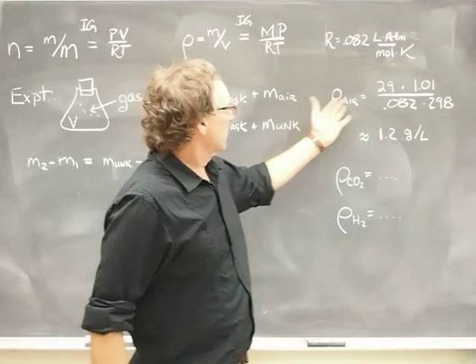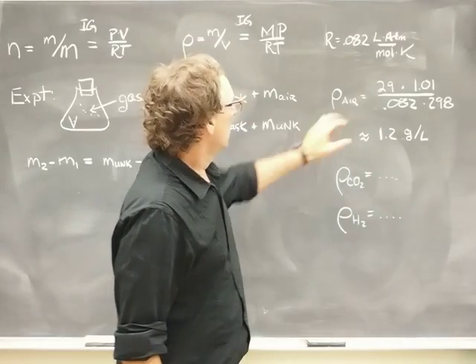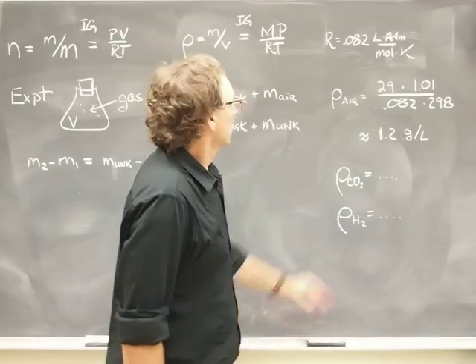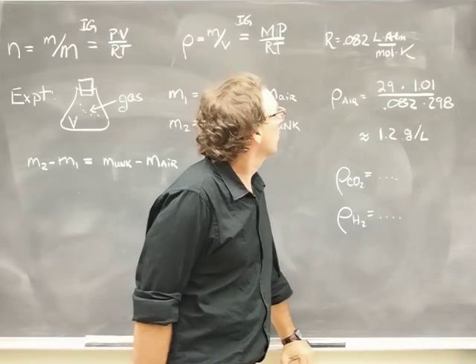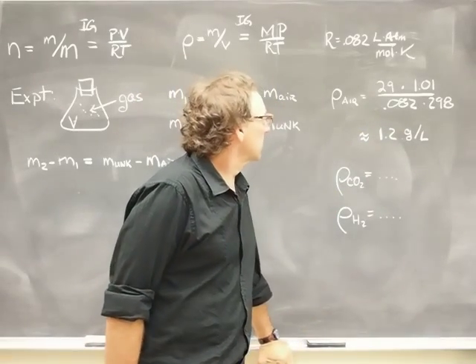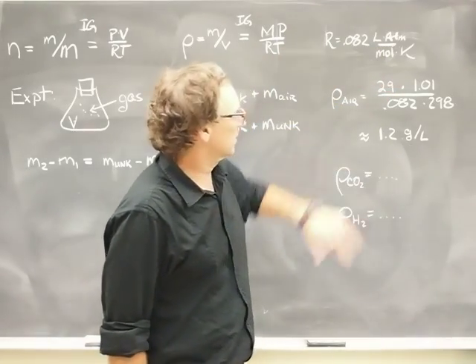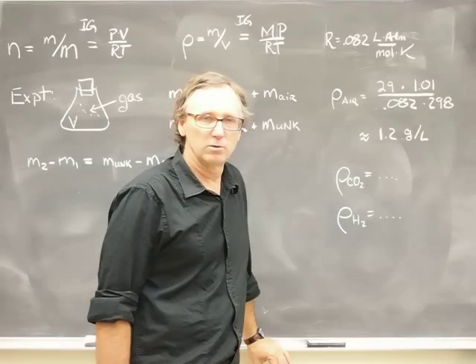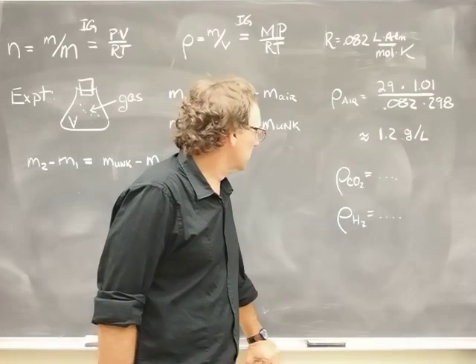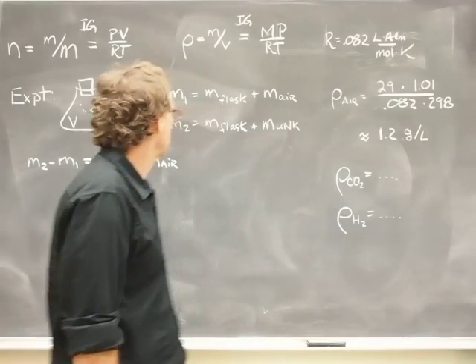That would be useful, for example, if you were trying to calculate the density of air, which I've kind of taken you through here. Air has a molar mass, that symbol there, about 29 grams per mole. Let's suppose you measure the pressure to be 1.01 atmospheres. There's R, and there's the temperature in Kelvin. And you'll want to take this through more carefully and also make sure you measure the actual pressure and the actual temperature. But the number that we're looking at is probably around 1.2 grams per liter. And you might want to do that for several other gases. All the other possible gases in the list of possible unknown gases would be another set of numbers like that.